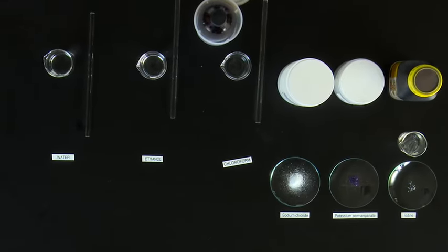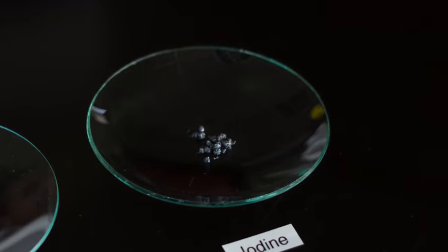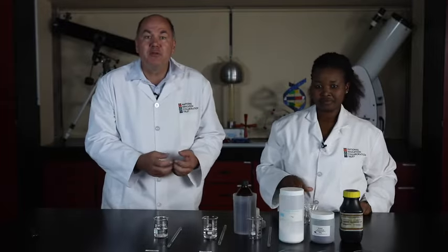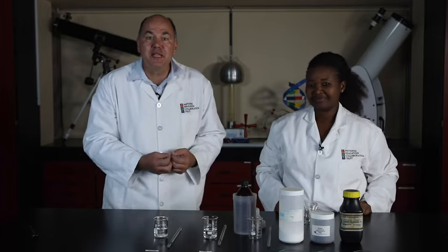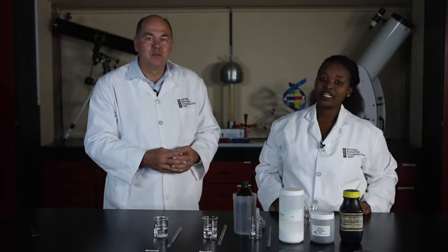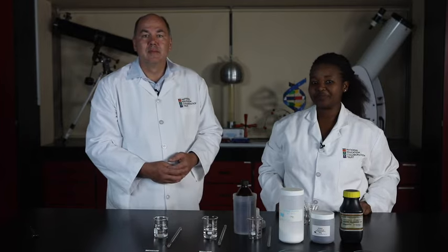The last solute is iodine. We're using iodine crystals which are also dark grey in color. We only need 2 or 3 of these to find out if iodine dissolves in these solvents, as pure iodine is quite an expensive substance. Right, we've set up 2 solvents in their beakers. We will add chloroform later.